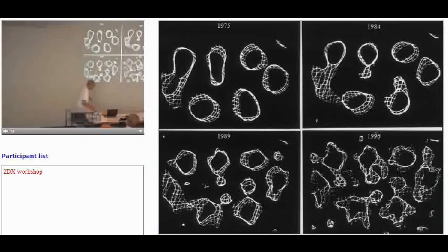So now there's a kind of giving you a feel for, this is a map Nigel Unwin and I calculated in 1975 on a 100 kV room temperature microscope without any freezing. And the spots are only about 5 times stronger. You only get a factor of 5 by going to liquid nitrogen, but it makes a fantastic difference.